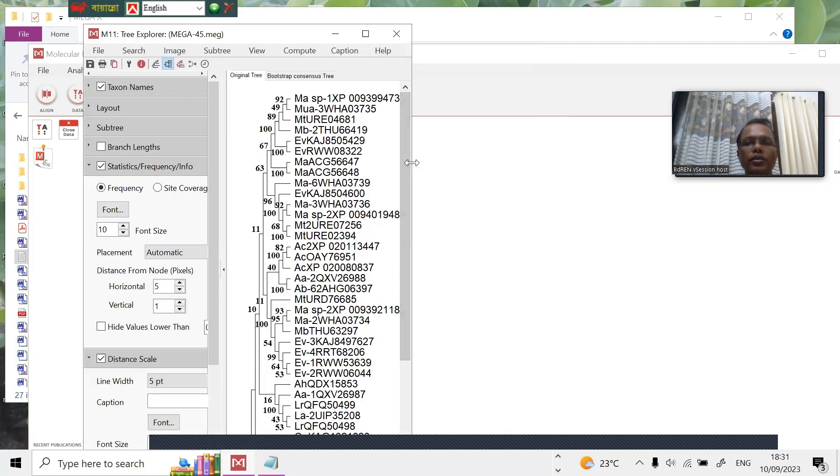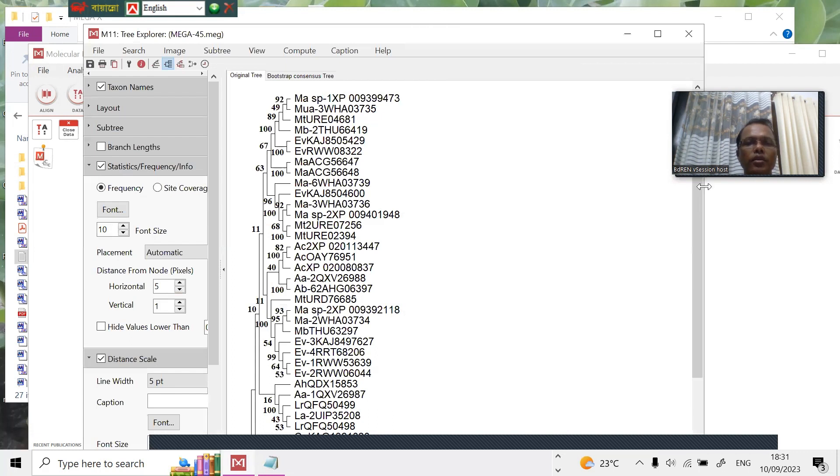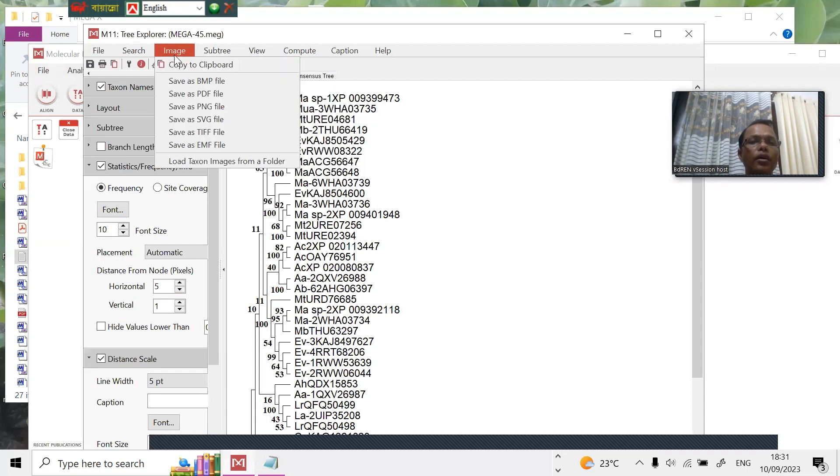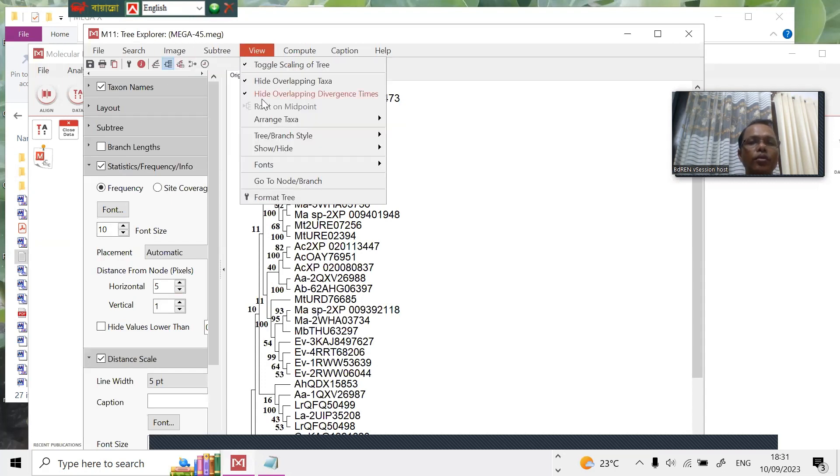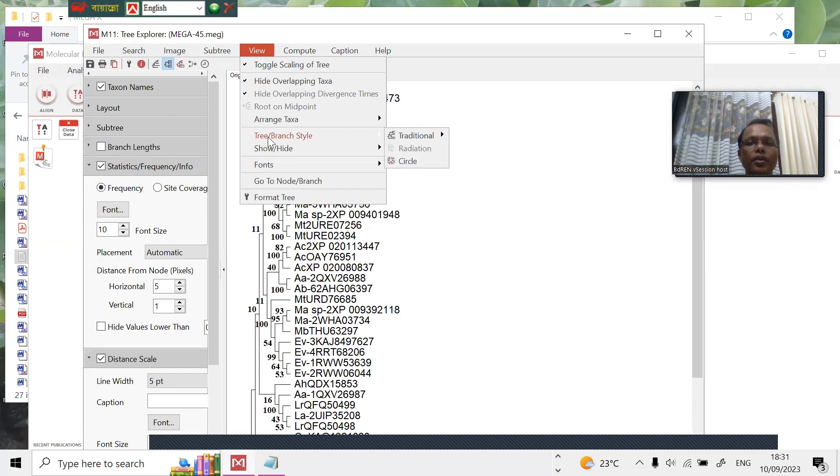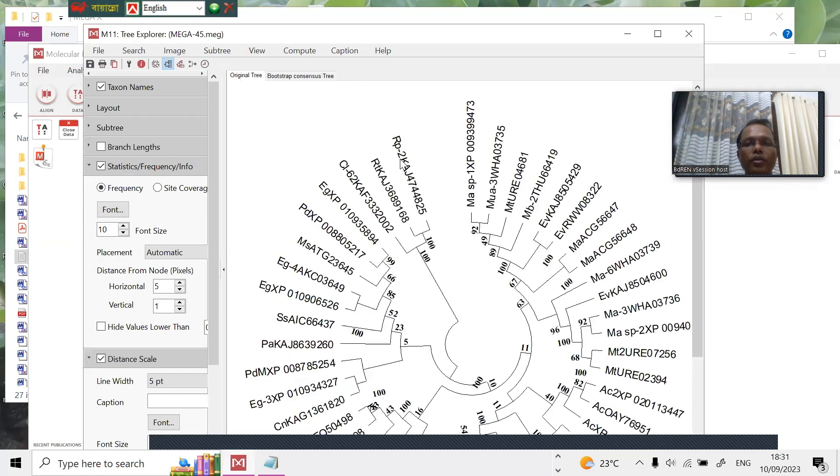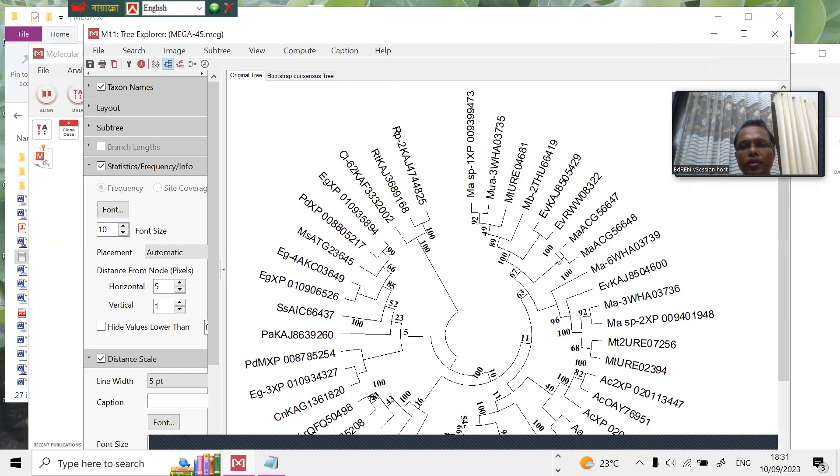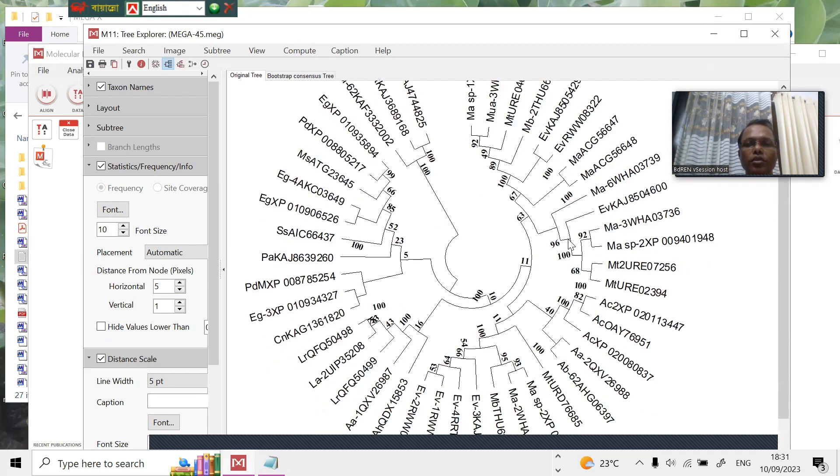This is our phylogenetic tree. You can view here, view tree, or circular. You can see the circular phylogenetic tree. Now you can download this tree.